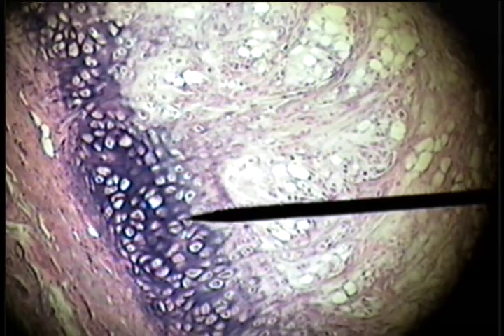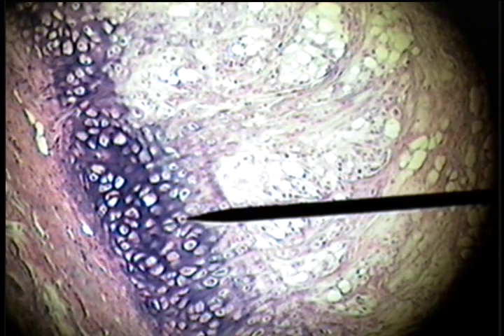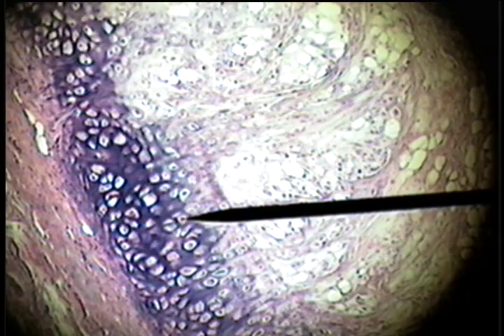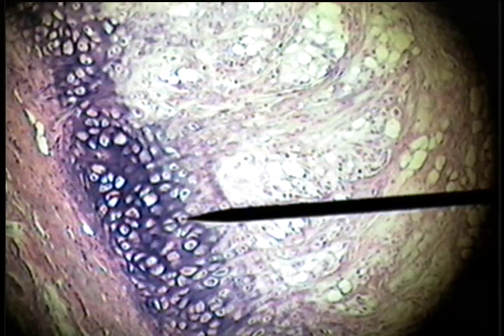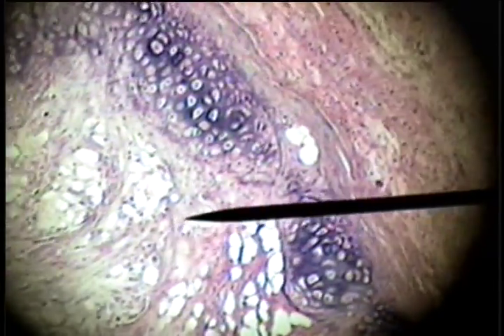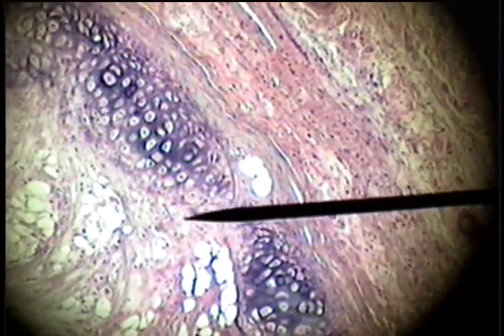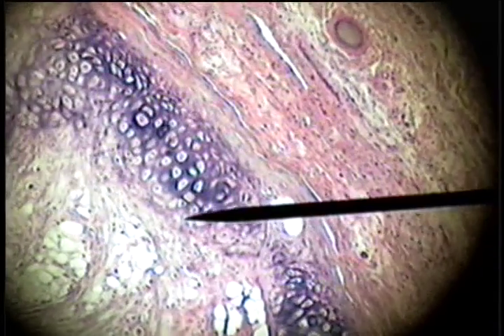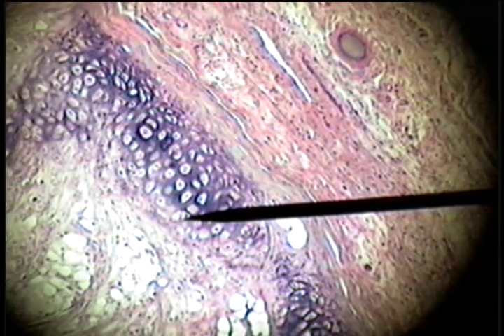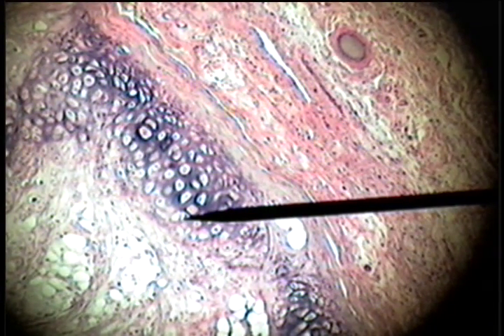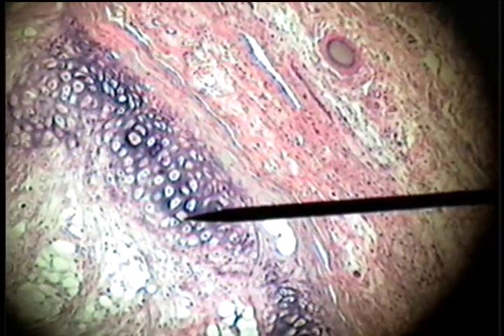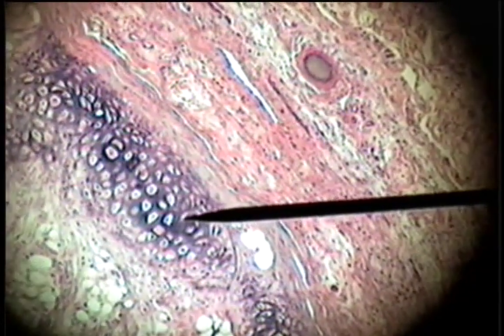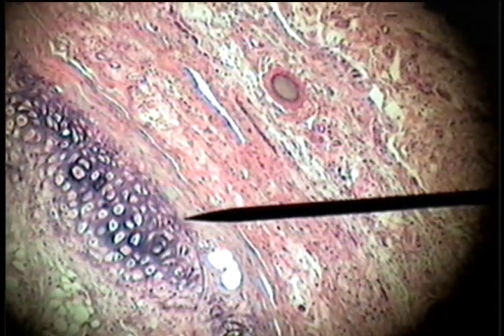Adult cells are found within the white lacunae, or spaces. If we go to the opposite side of the epiglottis, we again see the fibrous matrix of elastic cartilage. This is elastic cartilage.